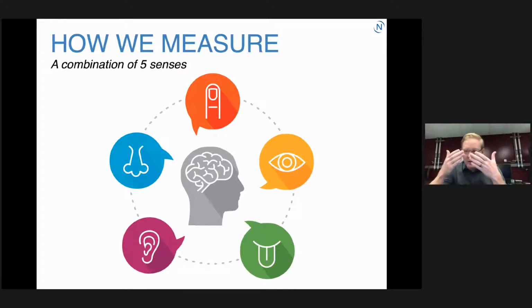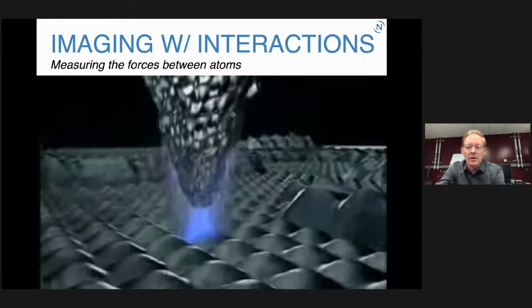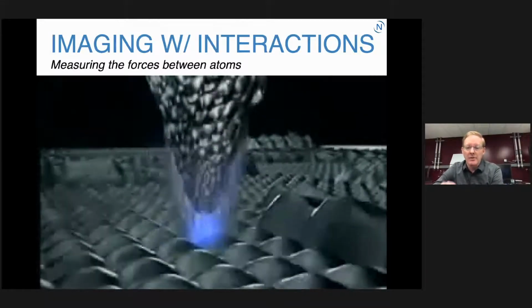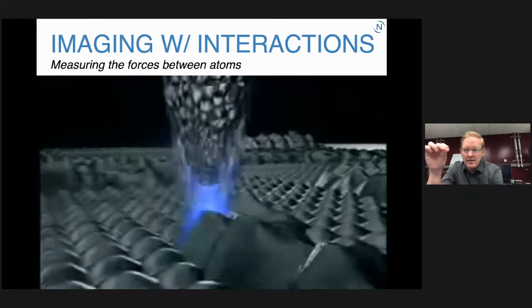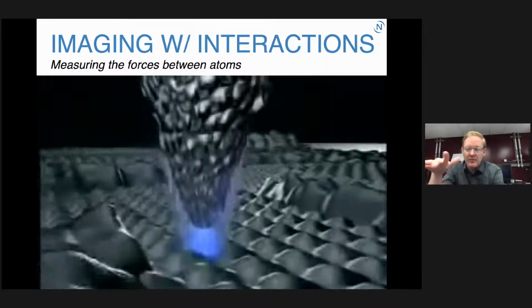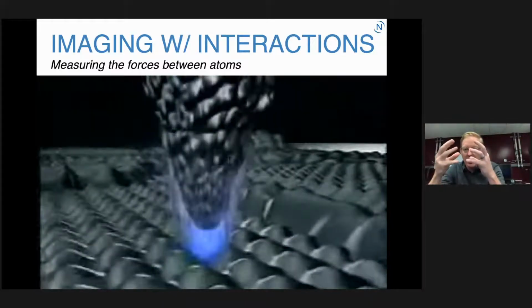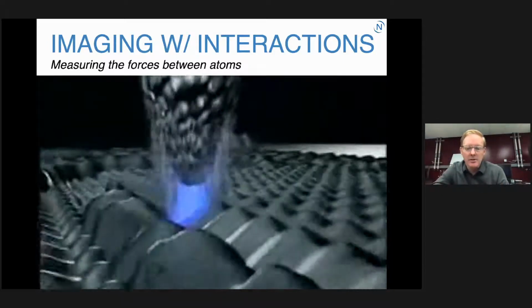But if I'm blind, I don't have that luxury, right? So there's a different class of techniques that are more recently developed that uses a tactile sense of interaction. And this is a class of techniques that we're going to call scanning probe microscopes, where we're physically going to be scanning a nanoscale, let's say, for the sake of analogy, finger across a surface and feeling it like a blind person would touch an object or read Braille, right, to physically understand its structure.